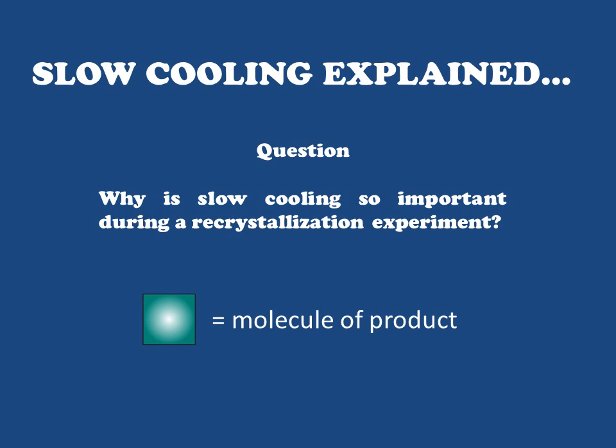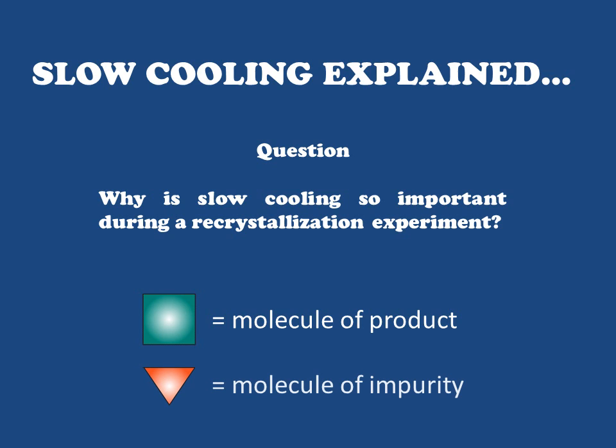To do this, we're going to have a few characters we have to think about. First, the molecule of our product, which is going to be represented by green squares. And then also, a particular impurity which I'm going to put in here as red triangles. So let's take a look at why it is that we have to cool a recrystallization sample so slowly.